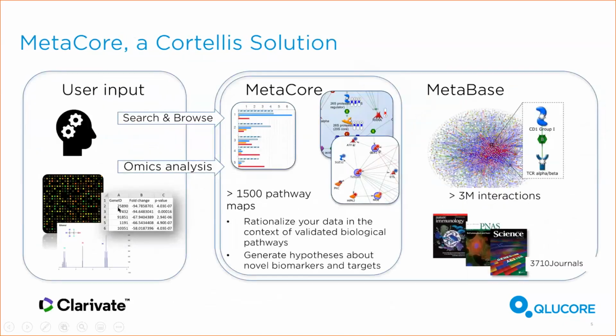And then Peter will present MetaCore. Okay, so MetaCore is a tool that helps you understand what's going on behind those results. So you might complete your analysis in Qlucore, upload the data to MetaCore, and here it's all about exploring the signaling pathways that explain results in omics data sets.